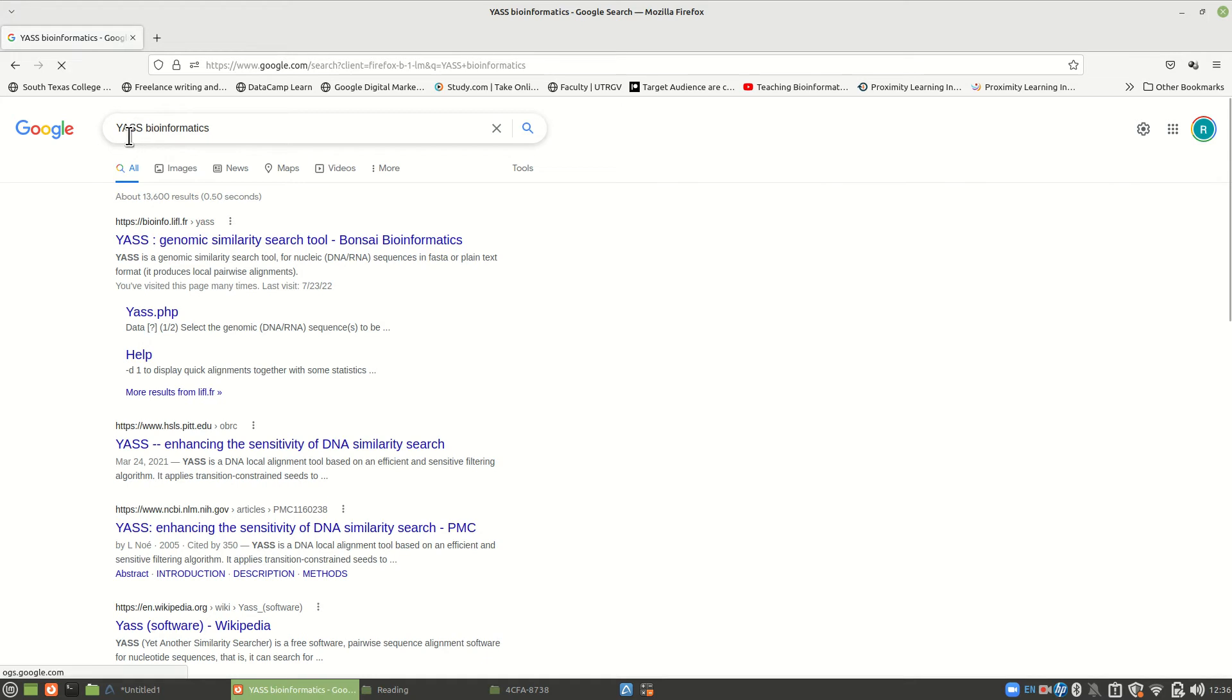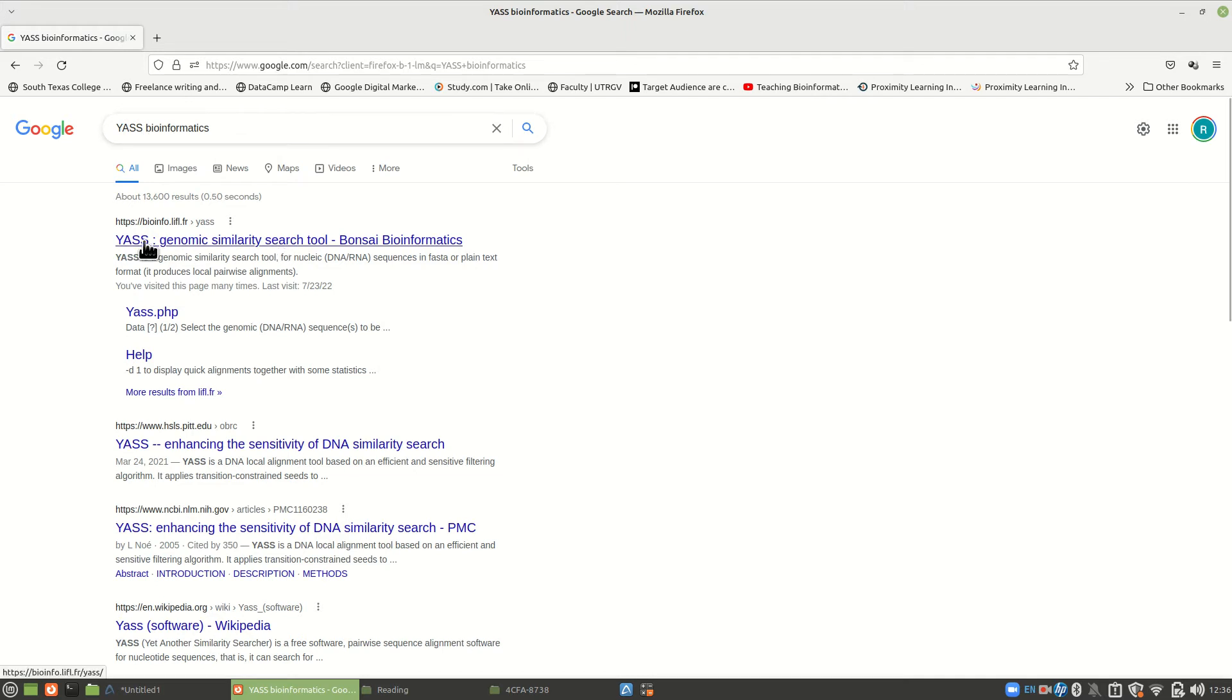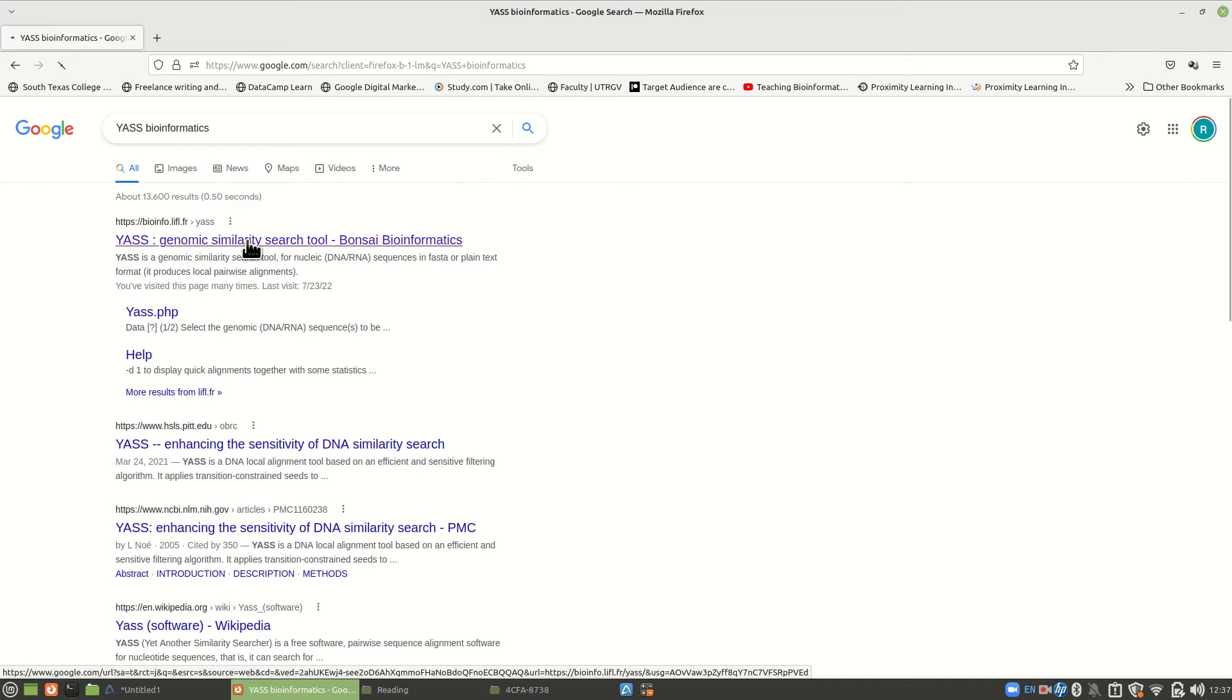When we search here, put in bioinformatics, because if you put in just YASS, it'll take you somewhere else. But if you put in bioinformatics, the first one here is YASS, Genomic Similarity Search Tool. So that's what we're looking for. Let's click on that.